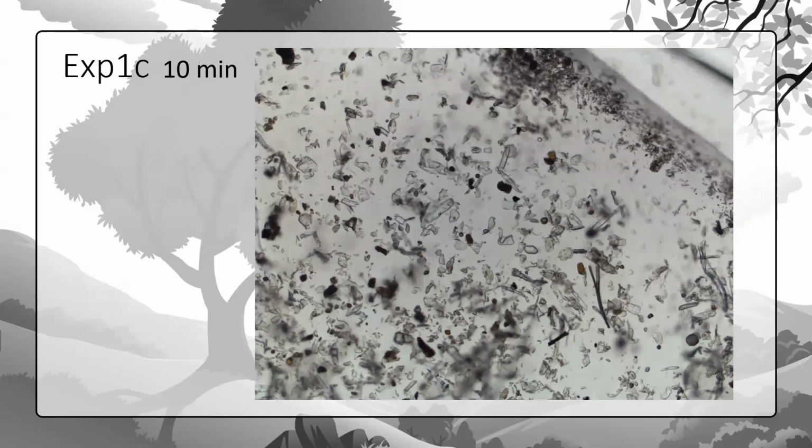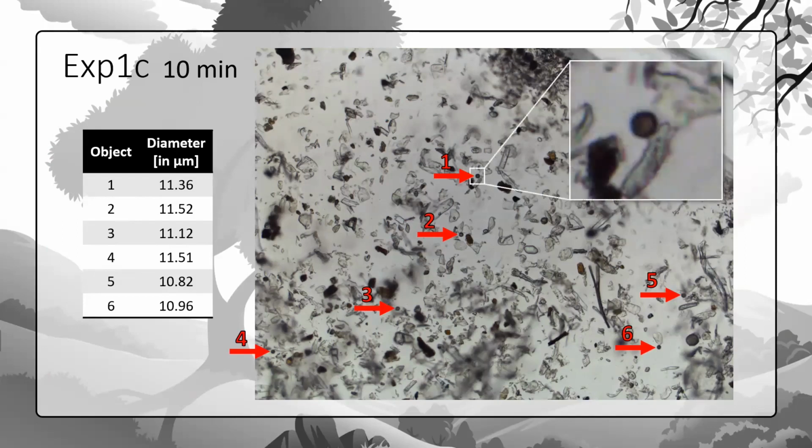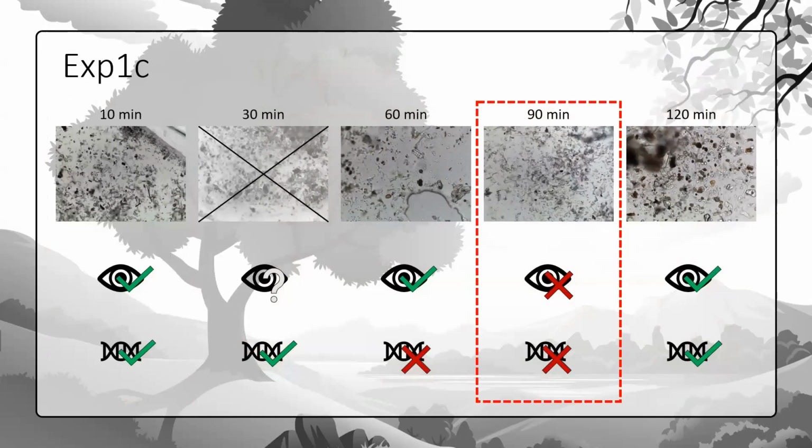Again, no high magnification on this part. If you look really hard, you find some of the spores. A quick measurement tells us it's in the ballpark of myxos. Trying to magnify it with the computer as much as possible. Going to the 90 minutes, where somehow we find nothing. And oops. With a sophisticated search algorithm, nothing was to be found.